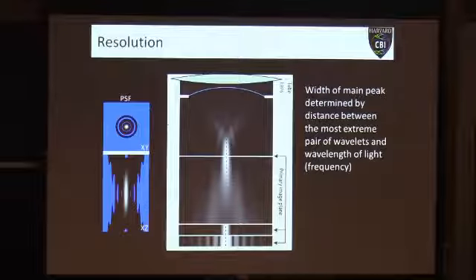This is what we call a PSF, or point spread function. So this is if you had an infinitely small point of light in your microscope. Once it passed through all of the optics and diffracted and got to your camera, it looks like this blurry spot with a bunch of rings around it. That's what it looks like in the XY dimension, and here's what it looks like in the axial dimension. And so you can see this looks exactly like this.